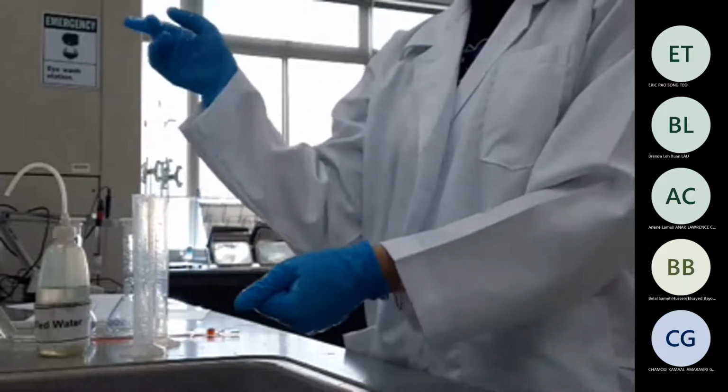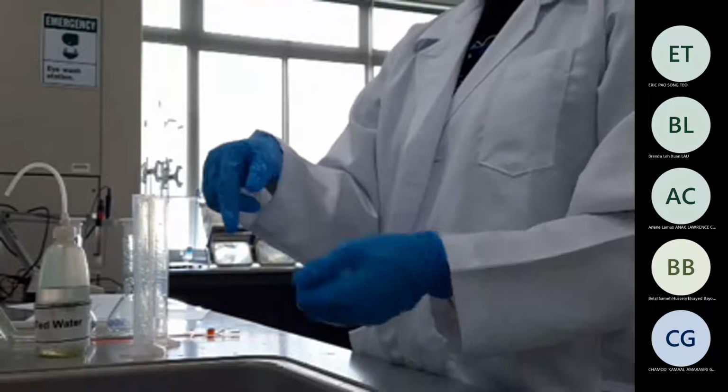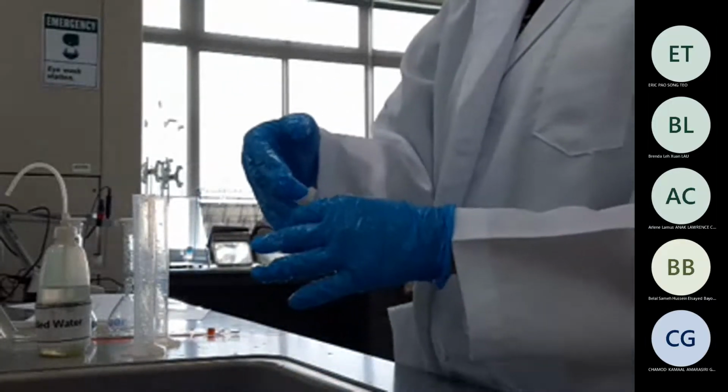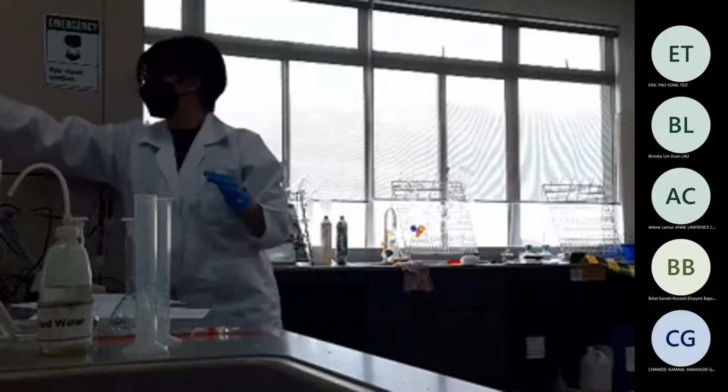Finish rinsing, we just take the beaker and go and get the chemicals, right? The beaker doesn't need to be rinsed, right? It's standard that you should rinse it, but I mean, just take 3 or 4 beakers.